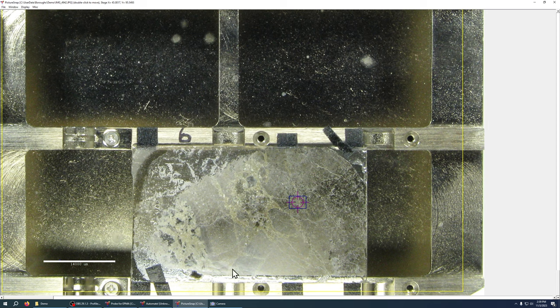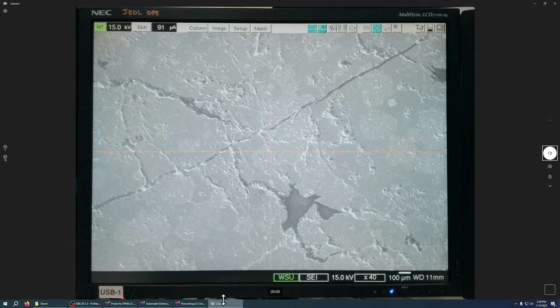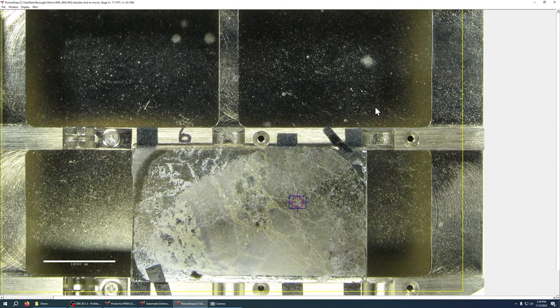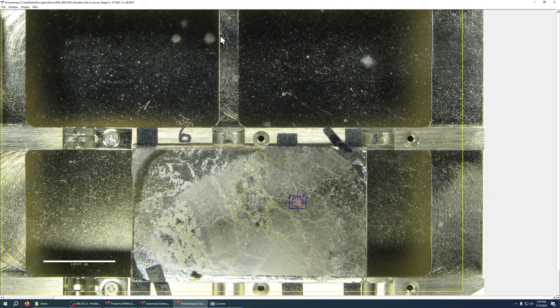But you can see just by clicking on it I got pretty dang close to that point. So that's navigating on picture snap.